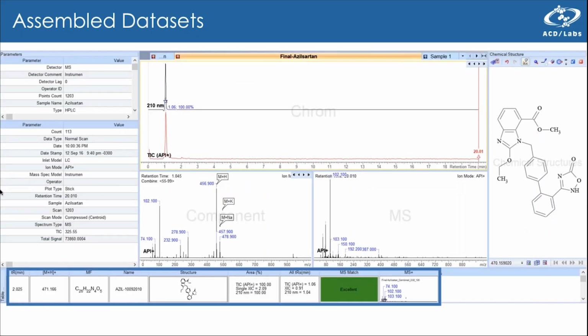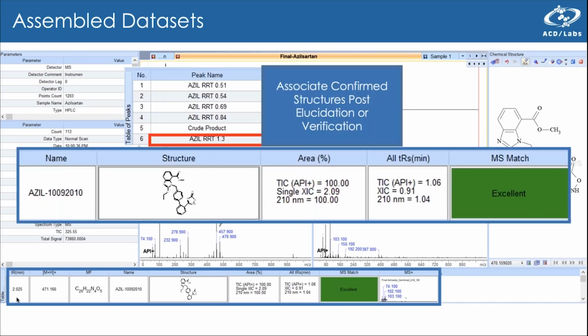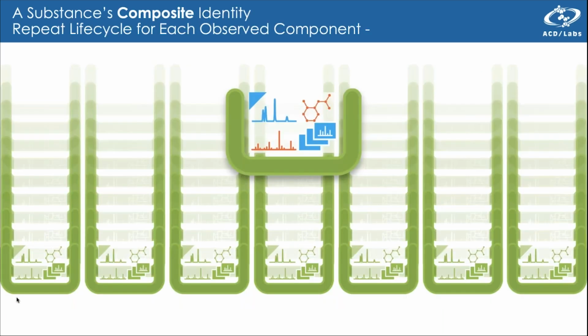And then from there, once you have a final structure, being able to go back and confirm in additional lots of materials produced, being able to confirm through spectral comparative analysis. Here's an MS assignment based on isotope pattern and fragment pattern, revealing an excellent match between the proposed structure and the corresponding spectroscopic data. Just to show the blow up here.